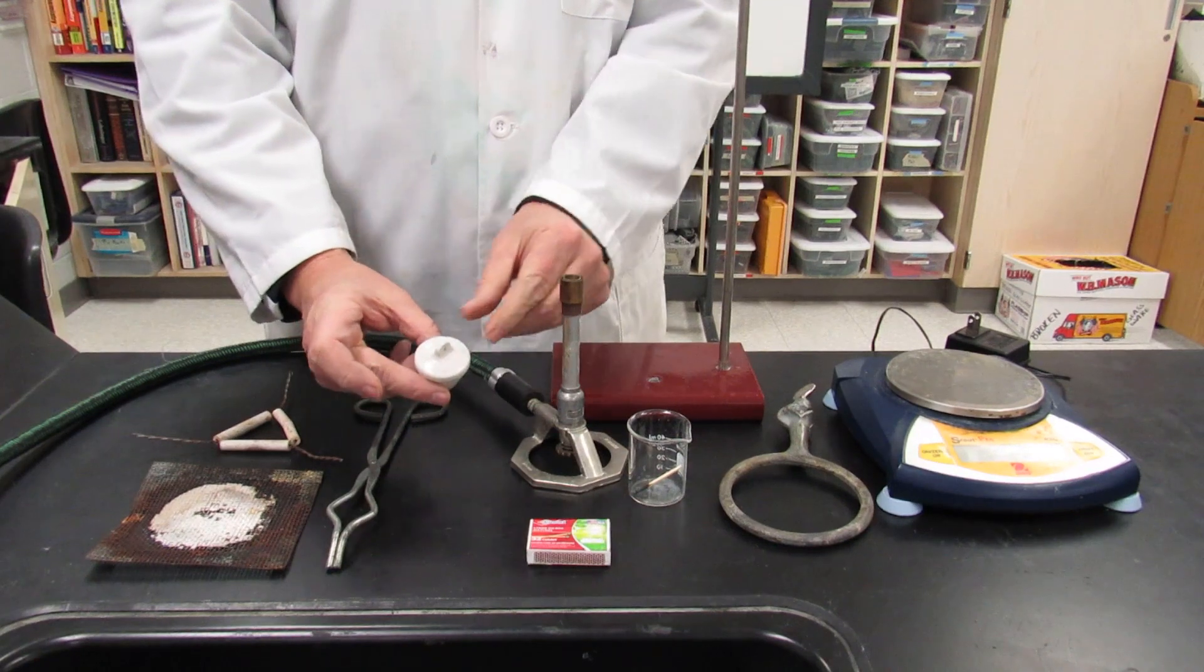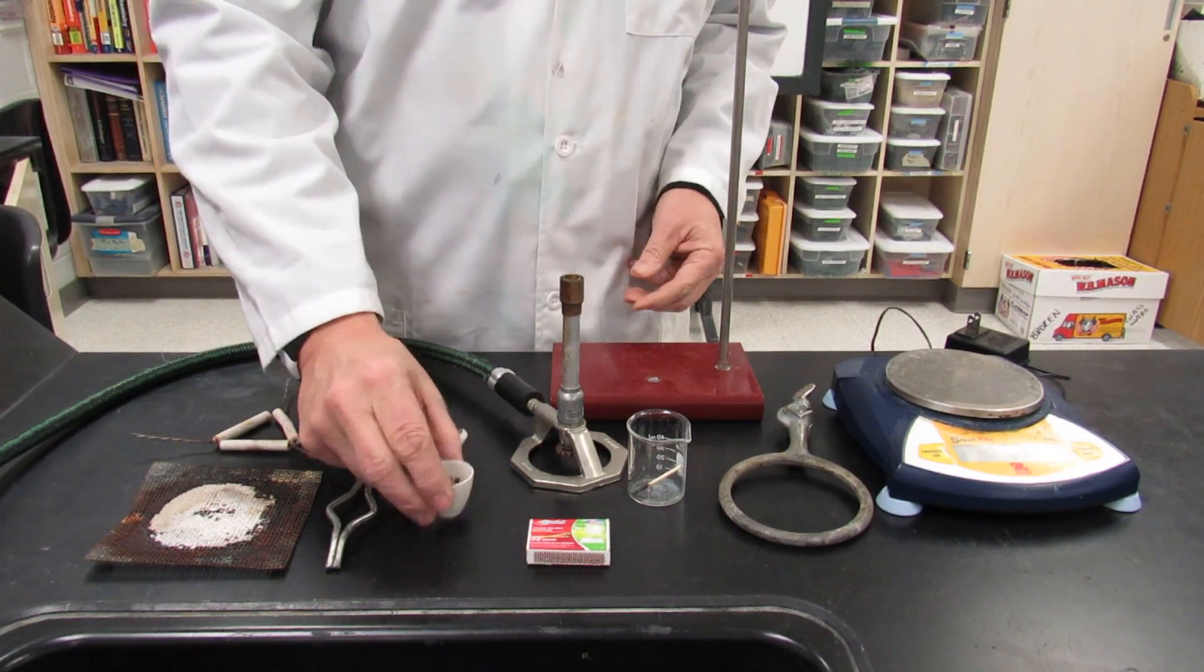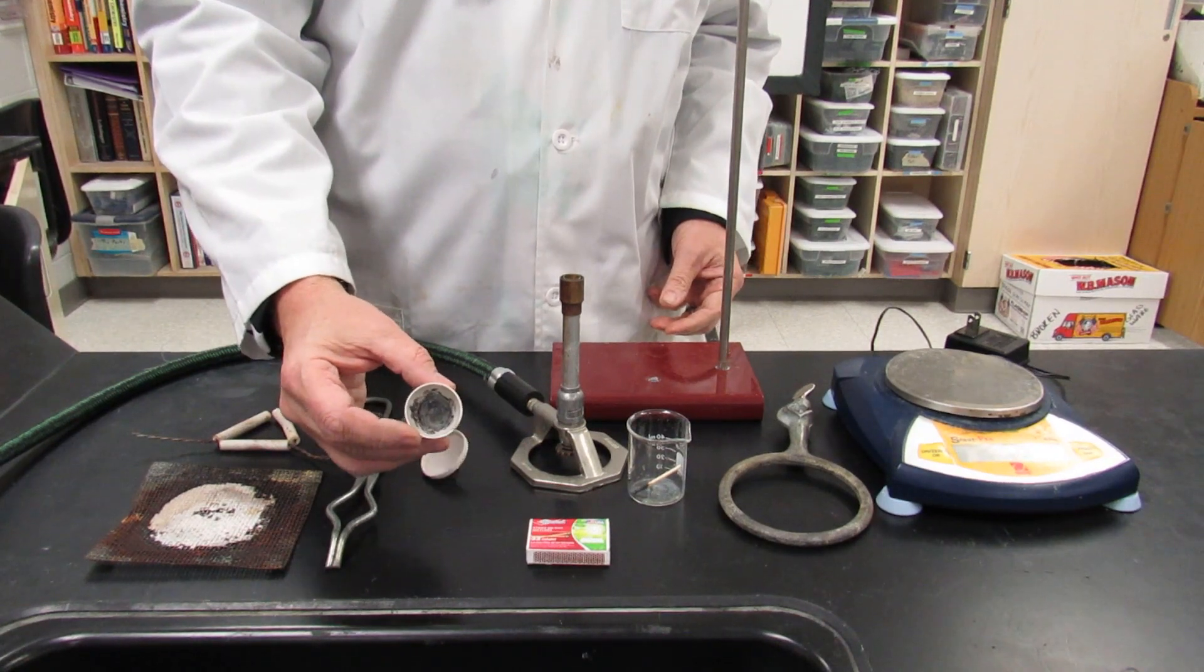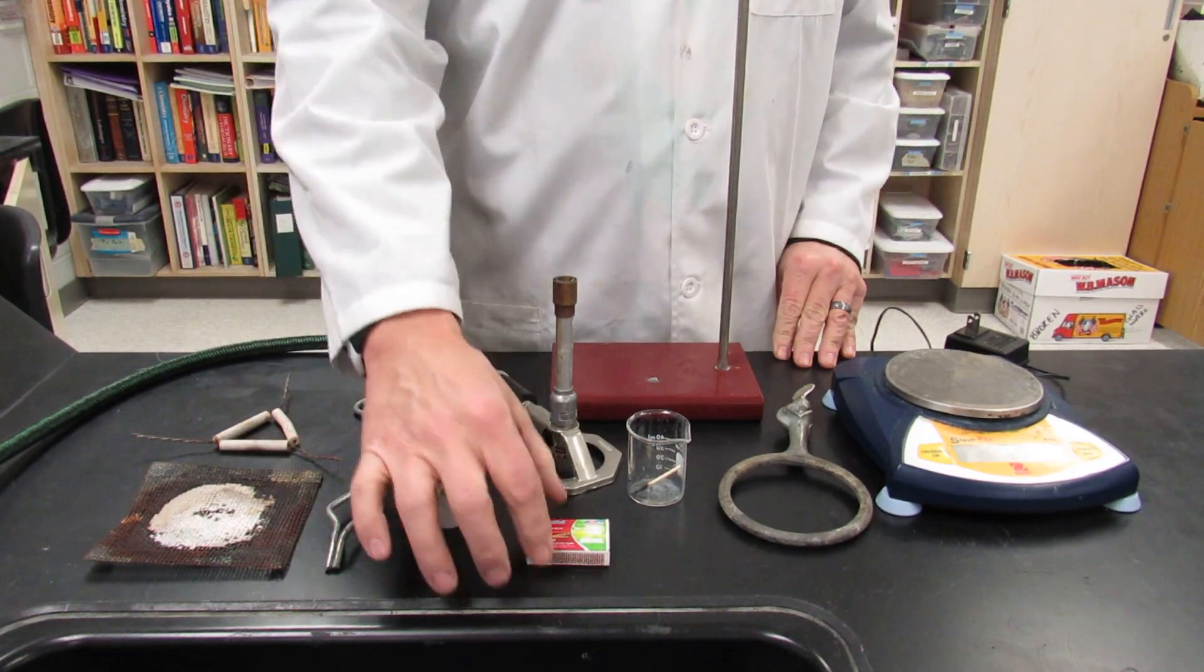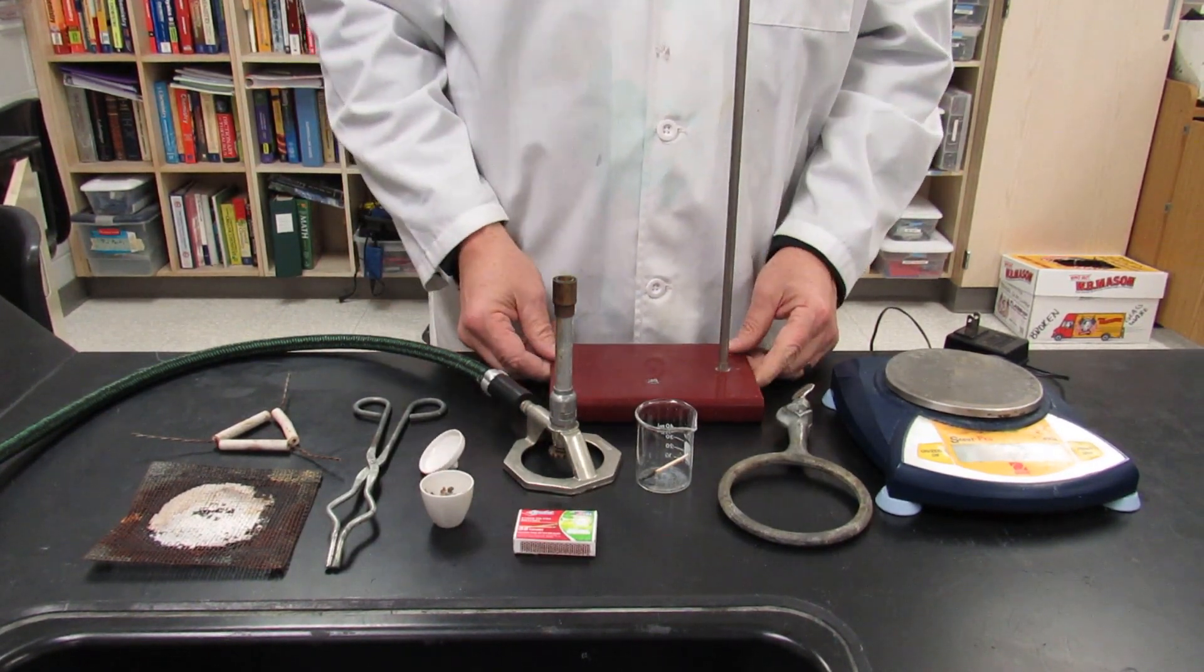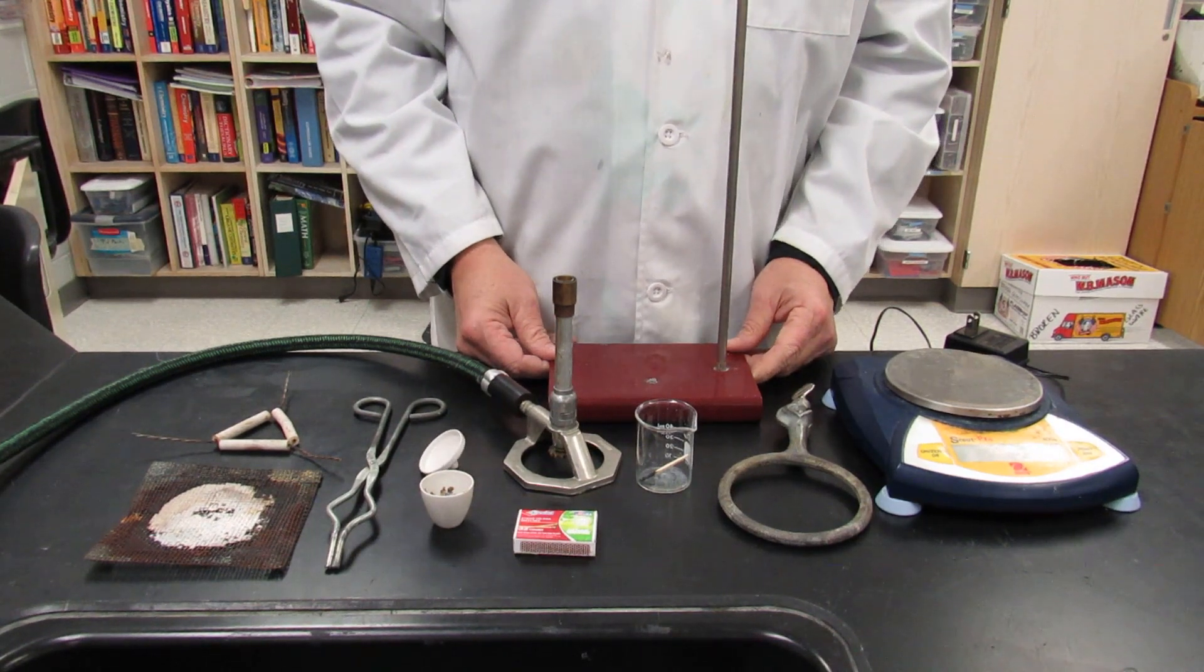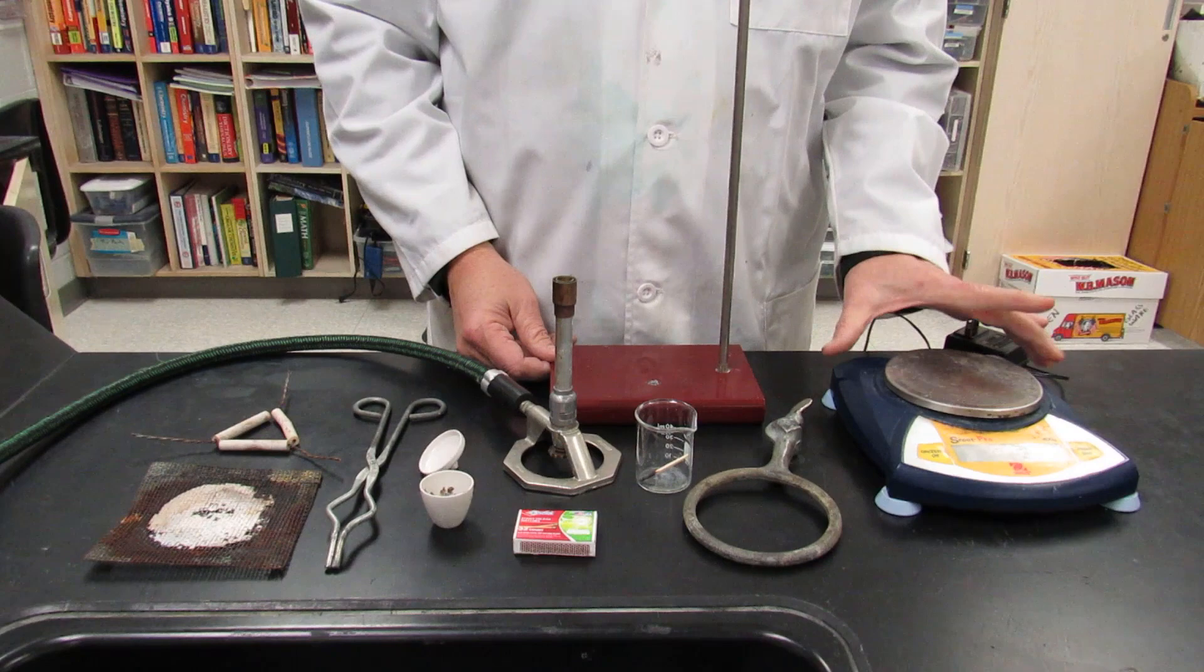The inside of the crucible is not very neat. It gets that way upon use. A Bunsen burner, matches, a small beaker for the waste matches, a ring stand, an iron ring, and a balance.